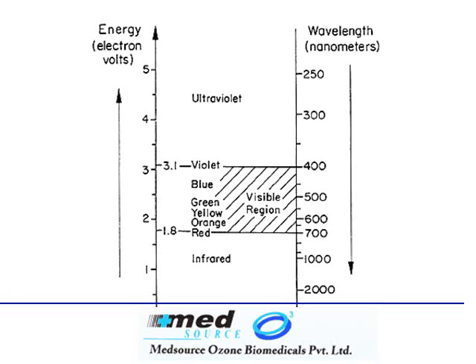This is why in a spectrophotometer we select the filter or the wavelength at which the color is being read or the sample is being read, and this corresponds to the exact color that we want to read within the sample.